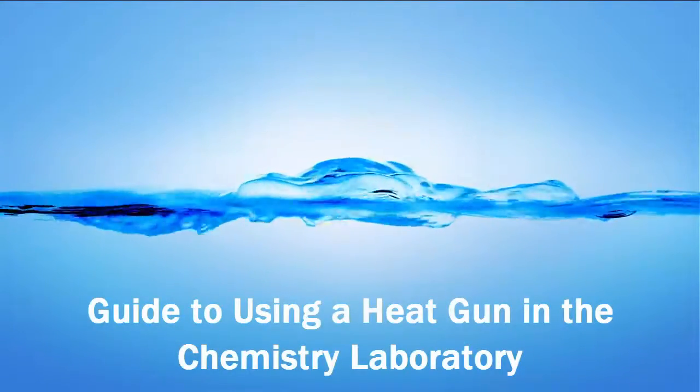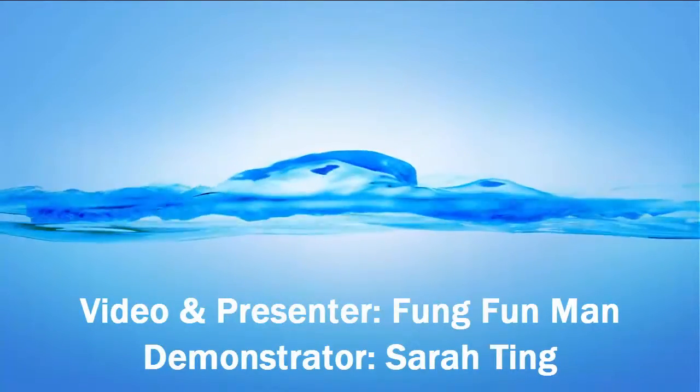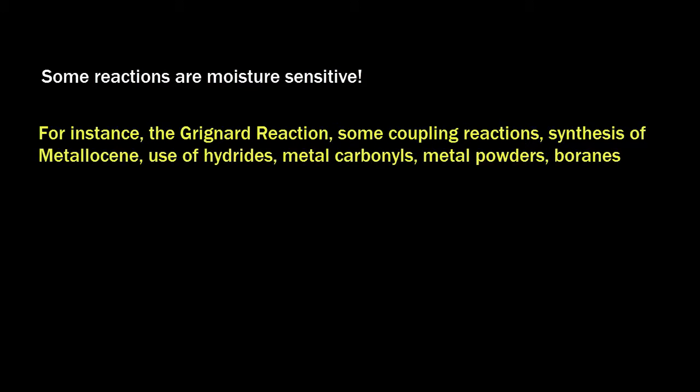Hi, I'm going to demonstrate how to use a heat gun in the chemistry laboratory. Using a heat gun is very important in some reactions because there are some specific reactions that are very moisture sensitive. Such reactions would include the Grignard reaction, some coupling reactions that involve nucleophiles, ferrocene, and ionic solvents.